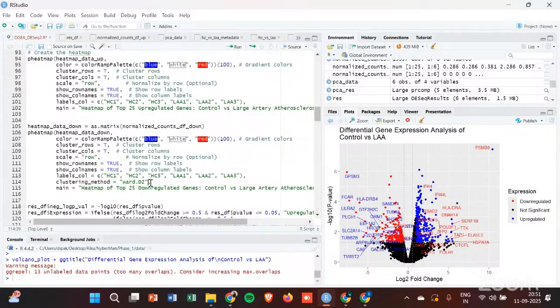Heatmap 3, if it is in R, it's an R package, right? Yeah, it should also have parameters for you to choose what clustering method you want. You can check the documentation. Ideally, it should. If it does not, you can always use pHeatmap. Okay, yeah.